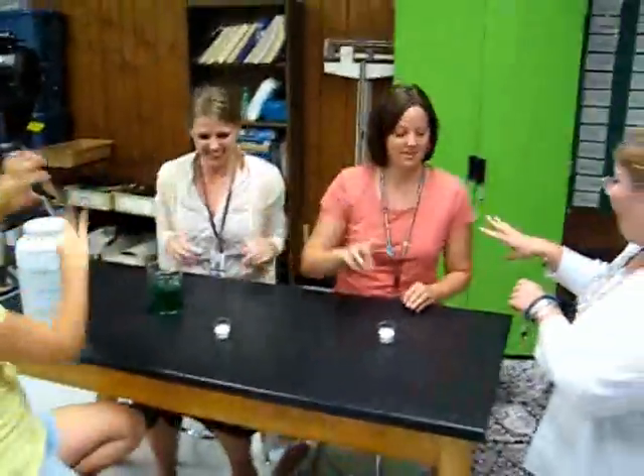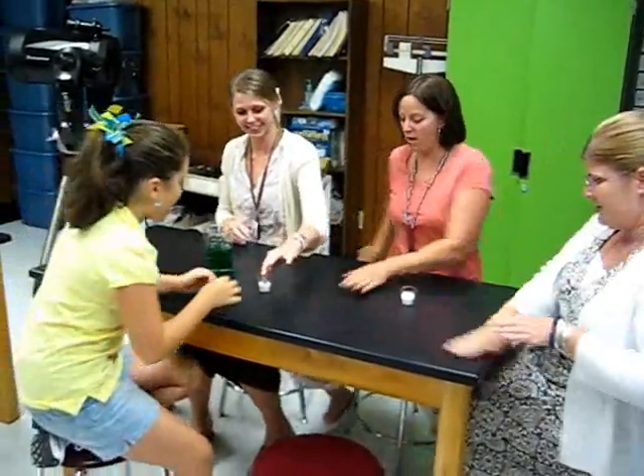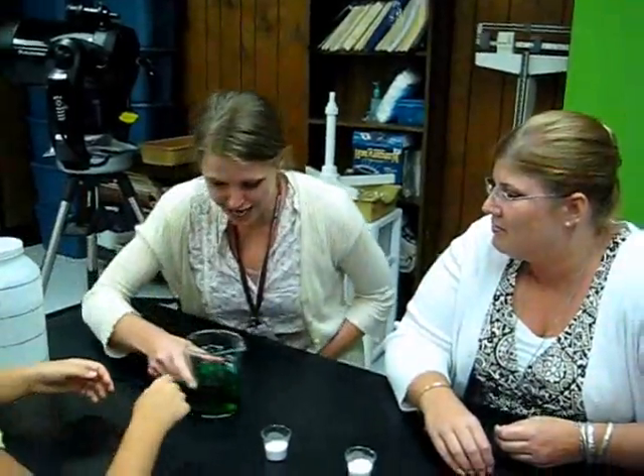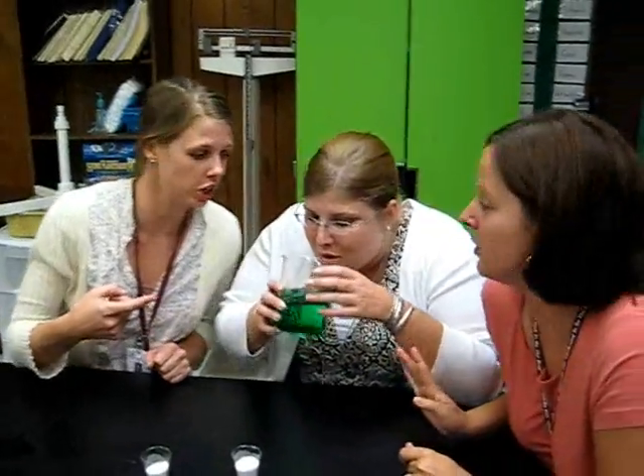Let's throw it on people. We don't have to clean it up. Ms. Stella has to do it. Just wipe it on the floor. What is this stuff? It's green! I think we should try it. We should totally try it. Hold on, I'm going to taste it. Look for the teacher. You're good, you're good. Go, go, go!